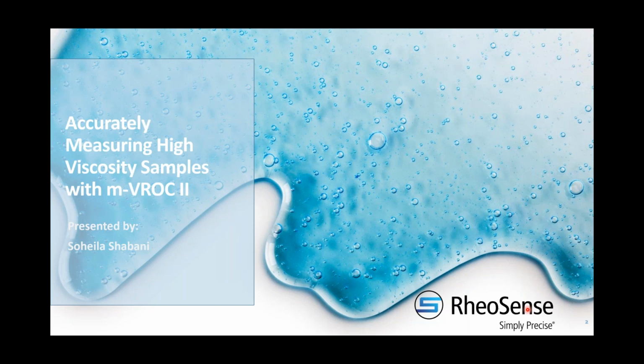I'm Soha, and today I'm going to talk to you about measuring high viscosity samples with m-VROC 2 and show you the capability of m-VROC 2 in handling high viscosity fluids.